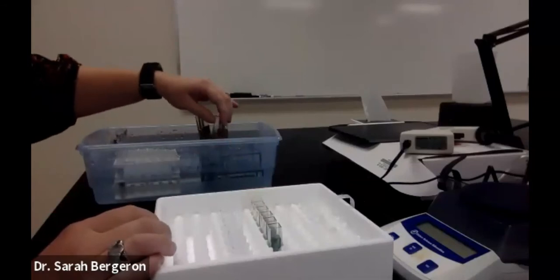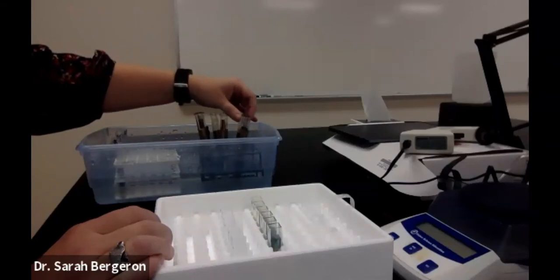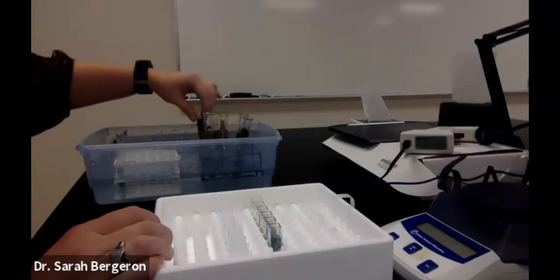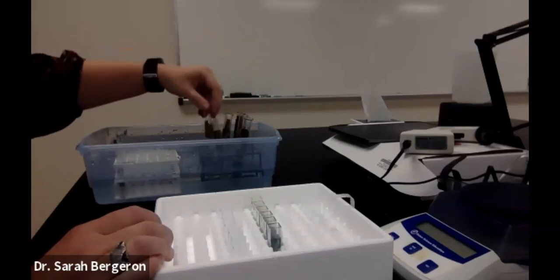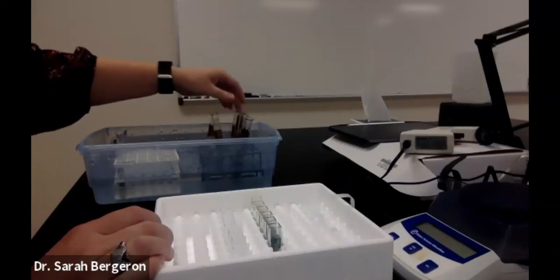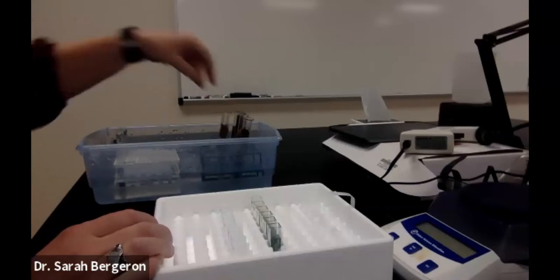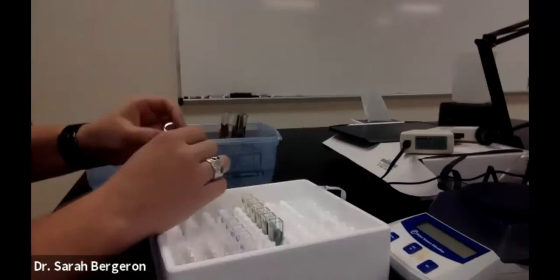So now I'm going to do my samples, well, your samples. I want to go in the right order, so I'm numbering them. 1 is LPC, 2 is SPH, 3 is PC, 4 is PSPI, 5 is PE, 6 is PA, and 7, they don't have a label, but you should have yours already done. Okay, so the first one is LPC.